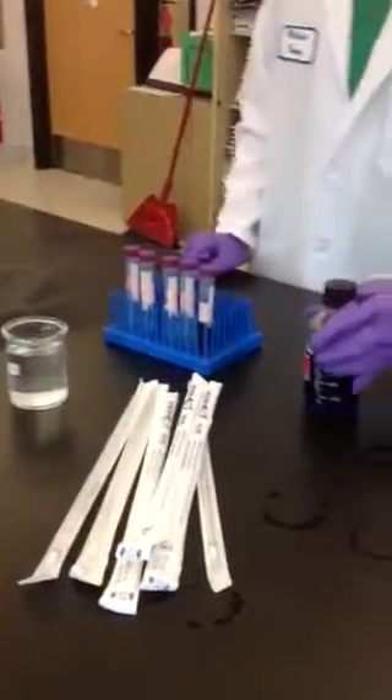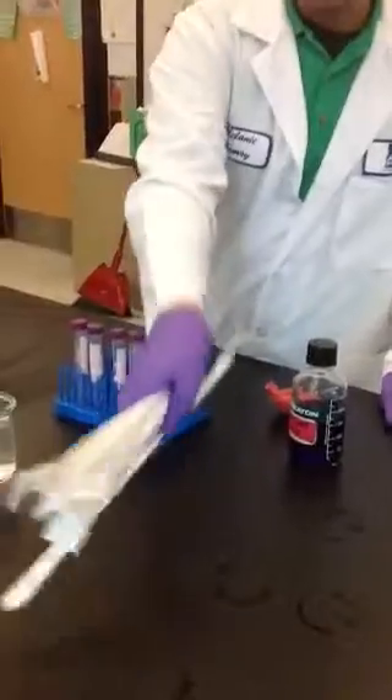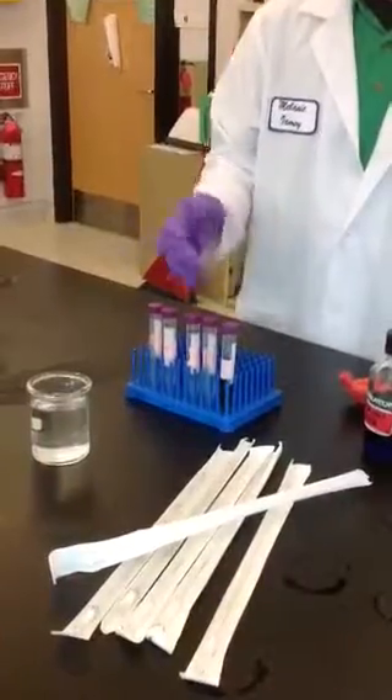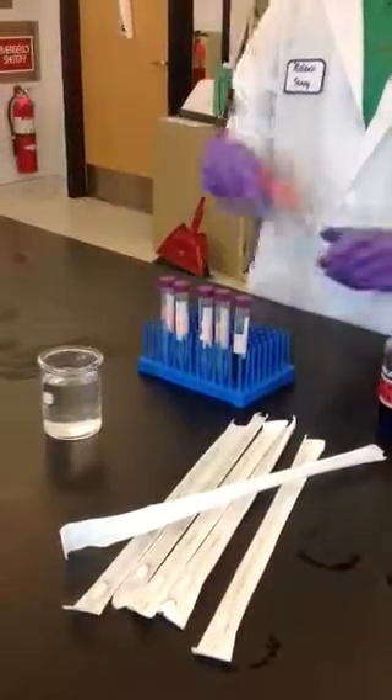Next, you're going to want to make sure that you have all your materials, which is your water, your 5ml serological pipettes, a beaker of water, 5-6ml pipettes, tubes, a tube rack, and a pipet bulb.